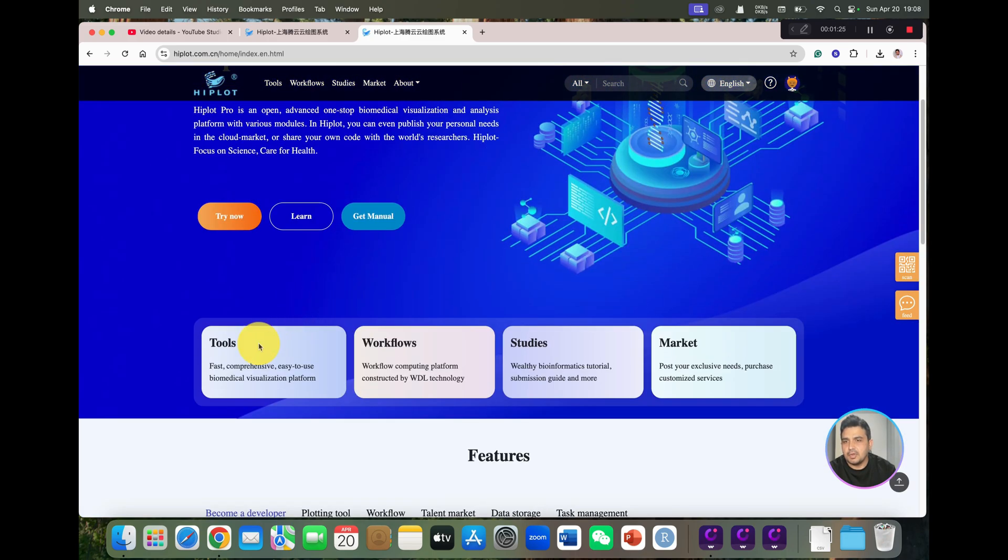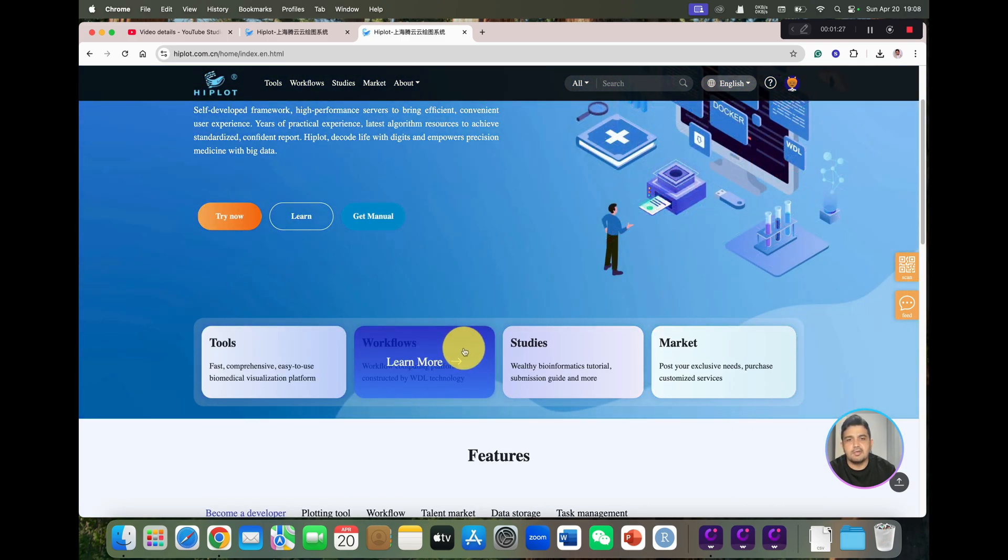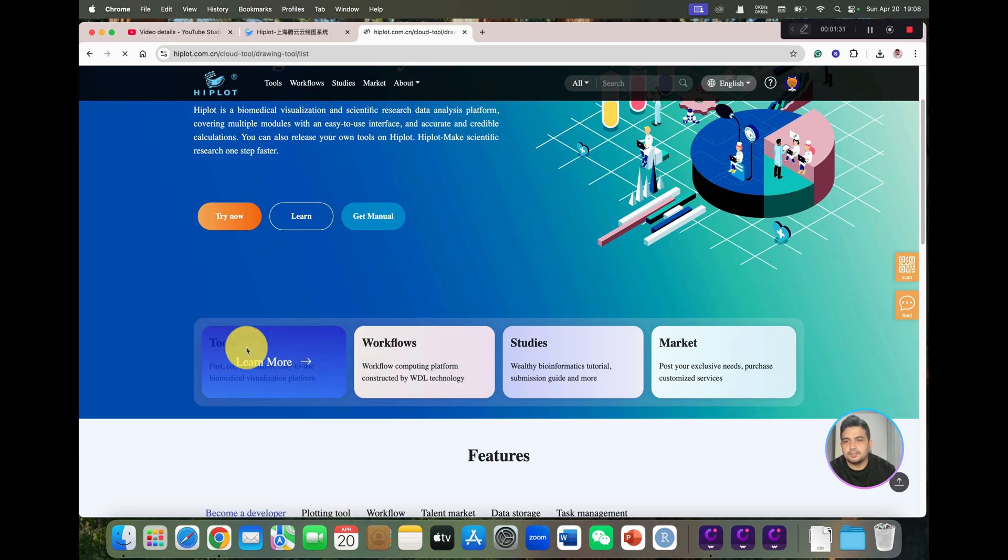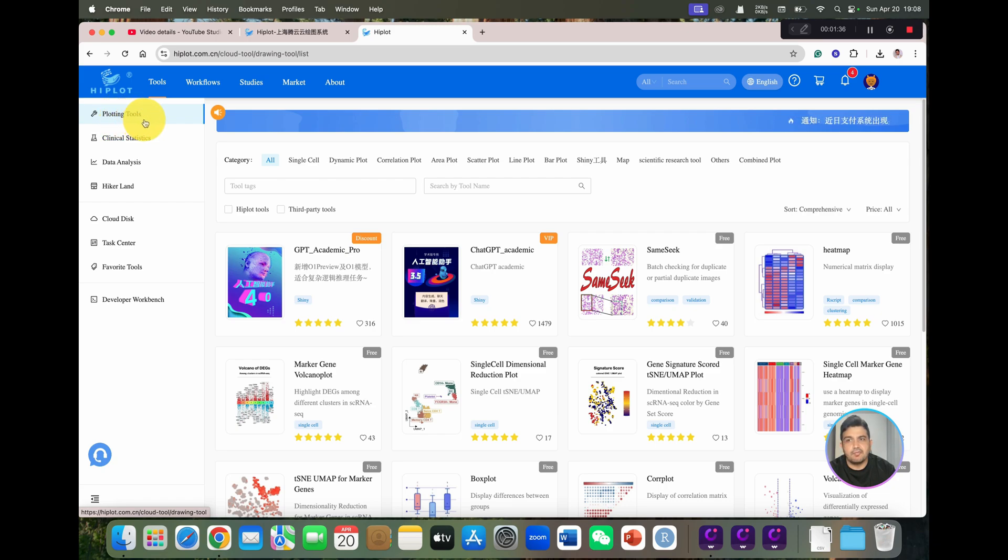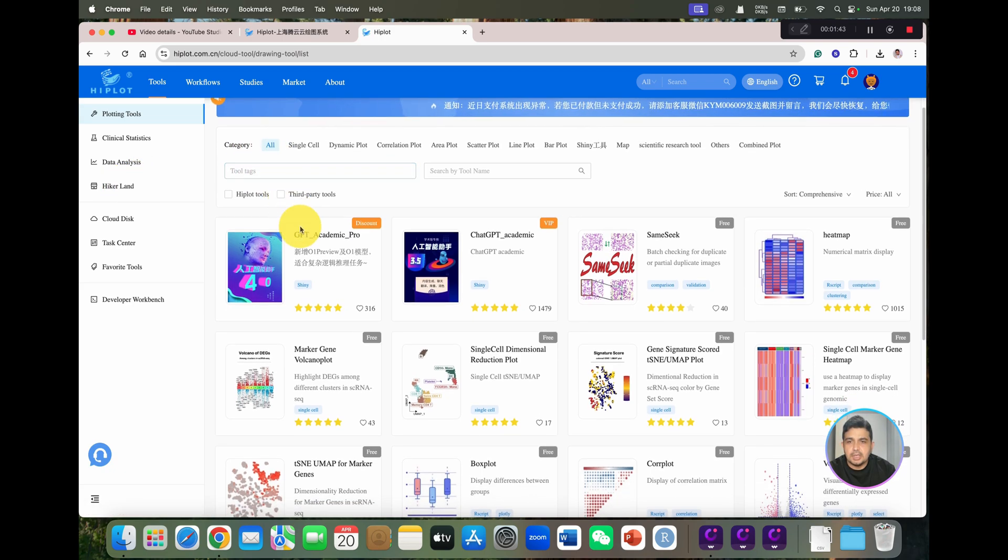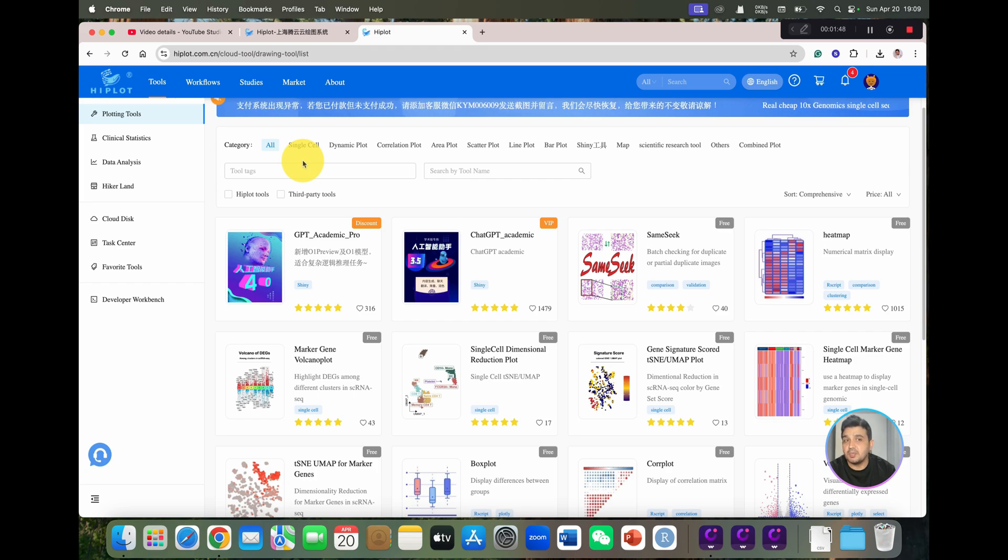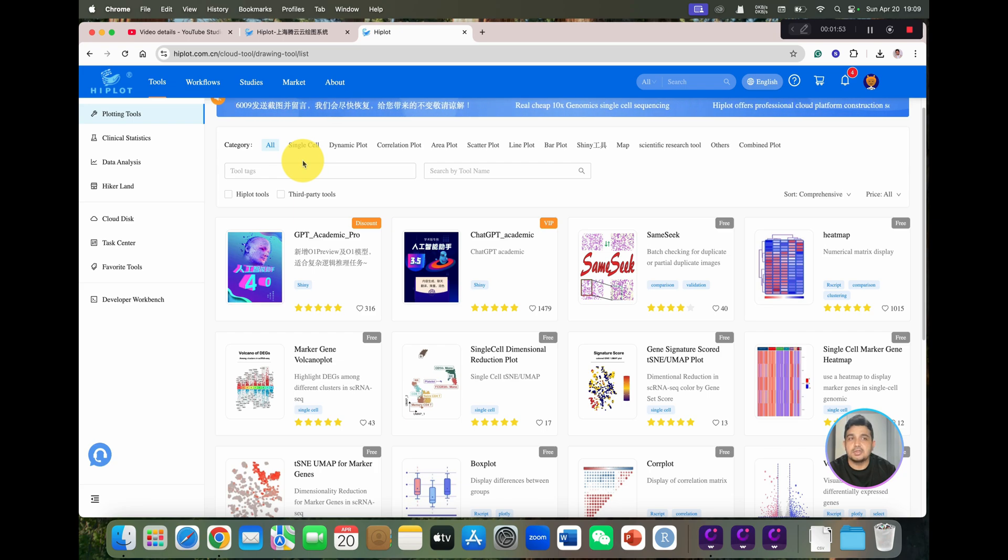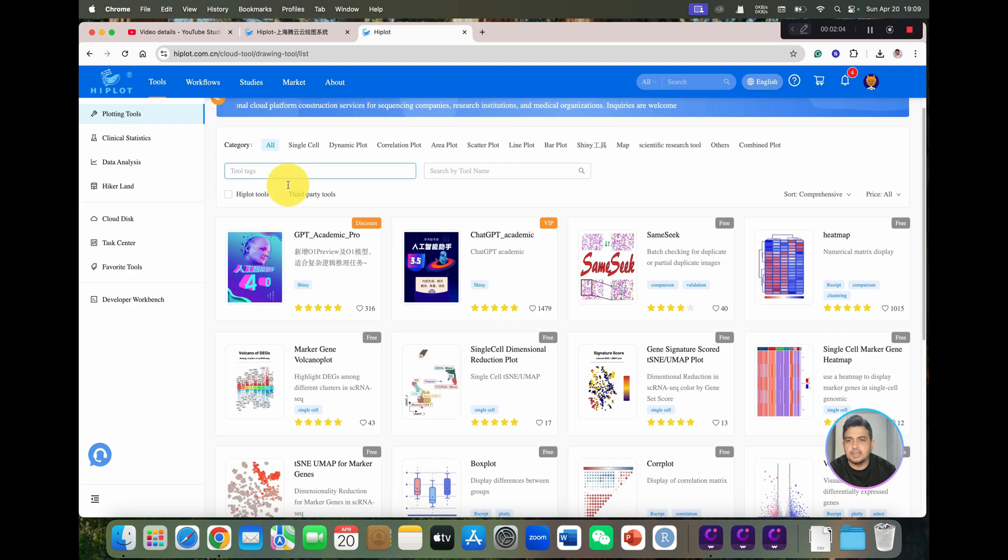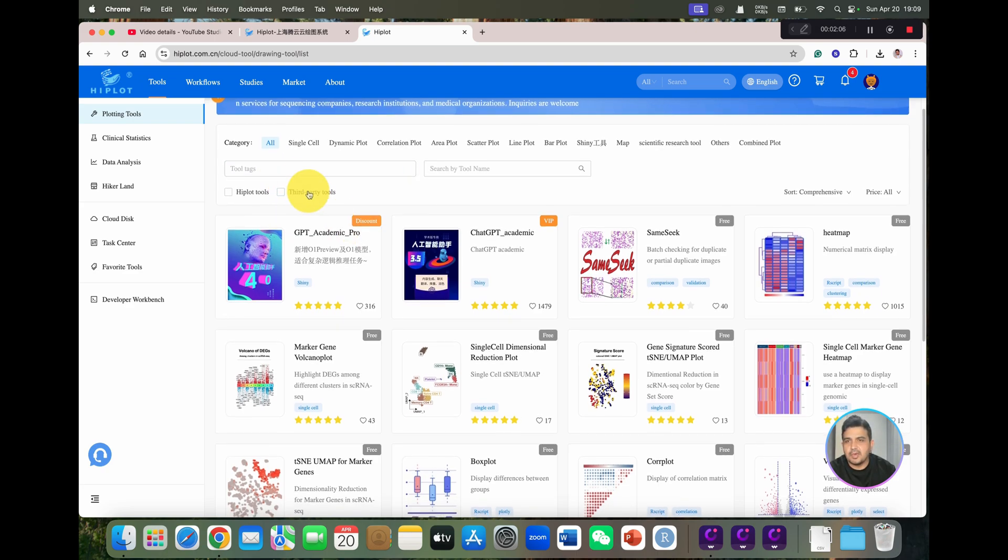If you can see here, we have tools and workflow. So first of all, let's explore its tools. As you can see, we have different options like plotting tools, clinical statistics, data analysis, and there are different categories of online tools in which you can simply paste your data from your file. And with just one click, you can get your graph ready. Here are all the categories. So let's explore one by one.